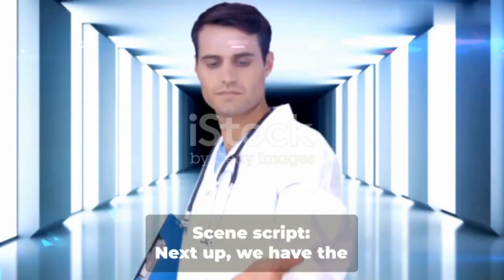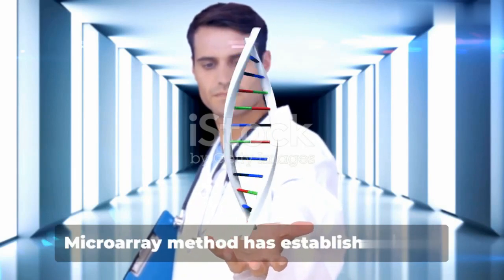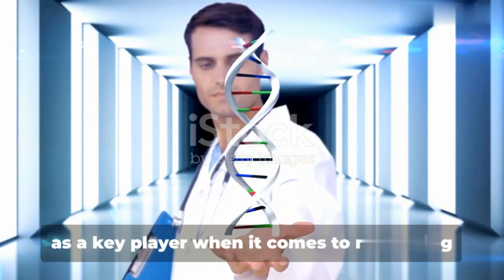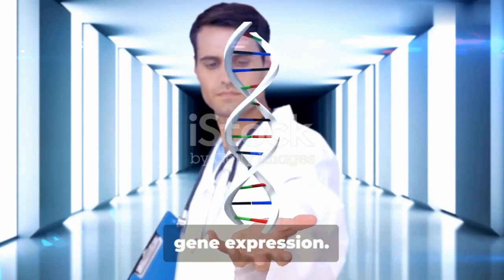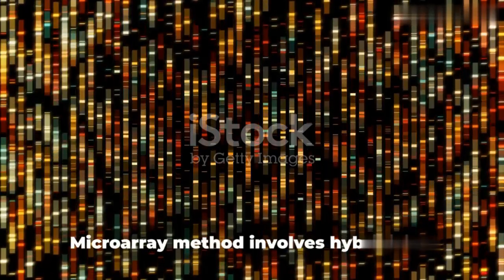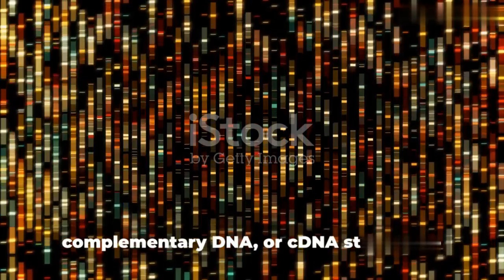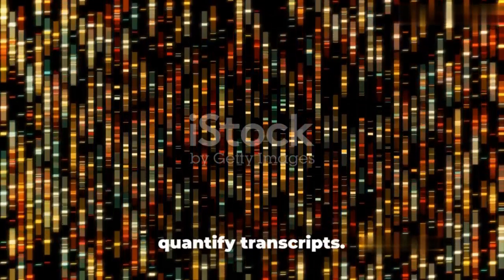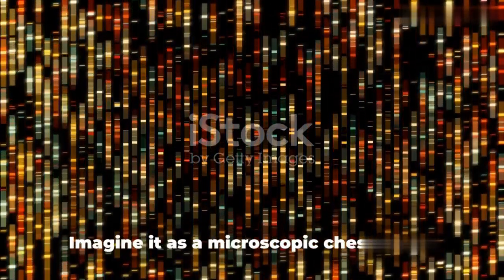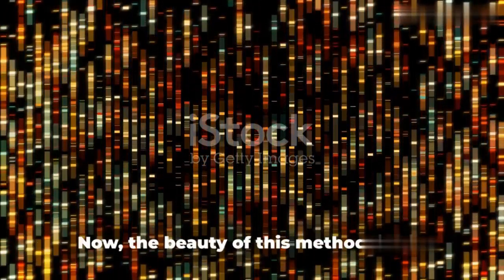Next up, we have the microarray method. In the world of genetic research, the microarray method has established itself as a key player when it comes to measuring gene expression. So what is it all about? Simply put, the microarray method involves hybridizing complementary DNA or cDNA strands to quantify transcripts. Imagine it as a microscopic chessboard, where each square represents a different gene.